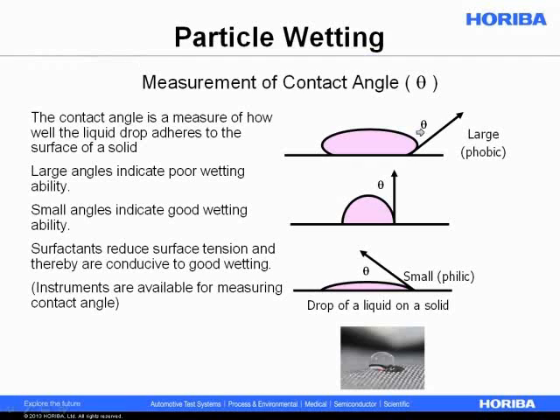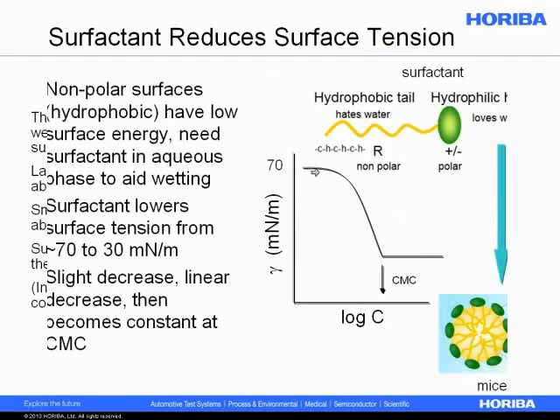With the Young equation, this contact angle is actually the boundary condition. Or we could just observe it. Down here I show a water drop on top of a cloth which has been treated, so it's highly hydrophobic. But usually if we want good wetting, we want small contact angles. And what we're often doing when preparing a powder sample for measurement is looking for ways to reduce that contact angle to make it more hydrophilic so that it will disperse readily in the solvent we've chosen. So we can talk about contact angle.